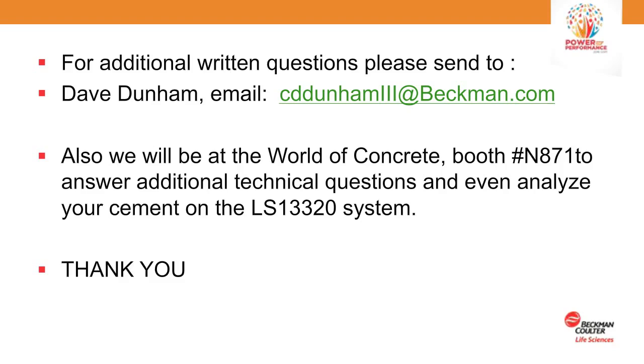And if you're going to be running just 1 or 2 shifts, that could be a little bit longer. I usually don't see or hear about lasers being replaced maybe 12 years out, 14 years out. So they last a long time.